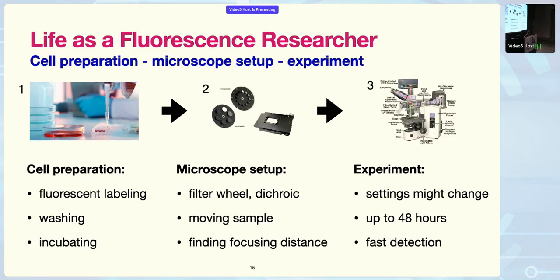So it can sometimes be less than a second for something to happen, which you want to capture. So I think the conclusion is that it's almost impossible to do this manually. For a very long time, doing things in different time intervals and do it very fast, it's impossible to do it manually. So the conclusion is we need software.